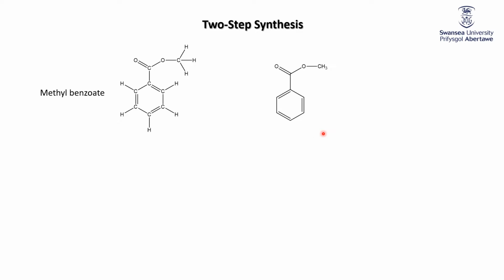What you need to note, and again, I'm casting back to hopefully some A-level studies for most of you, maybe some foundation studies, is that you have two functional groups in this molecule. You've got this benzene ring here that likes to undergo substitution reactions, and you have an ester group here that's really rather boring. The main thing an ester group will do is just hydrolyze to cleave off the organic part here and give you the acid back again. And the two steps of this reaction are to do each of those types of reactions sequentially.